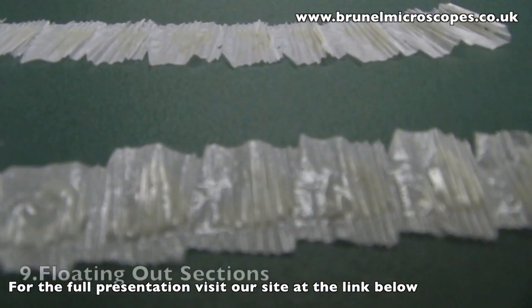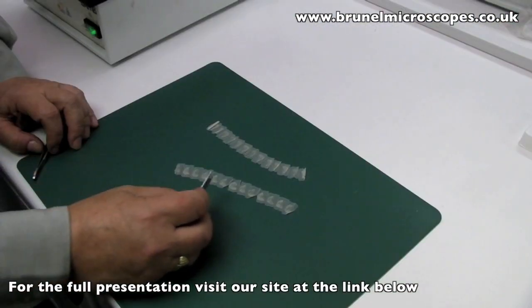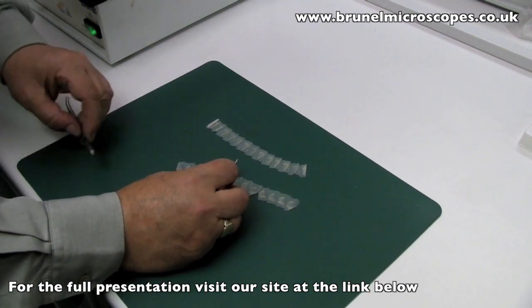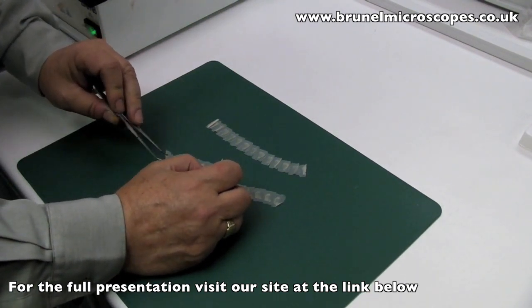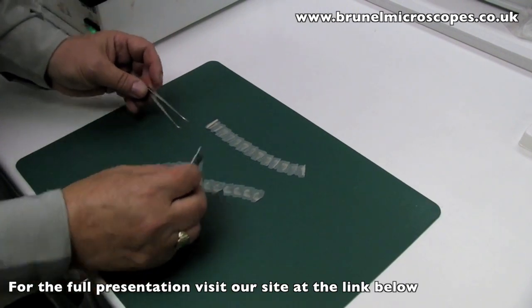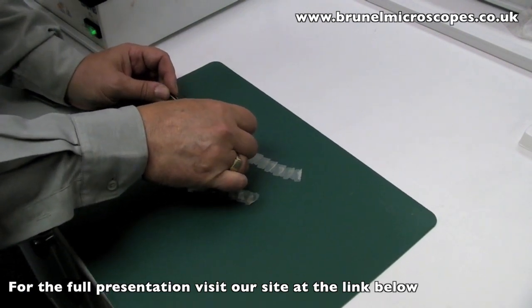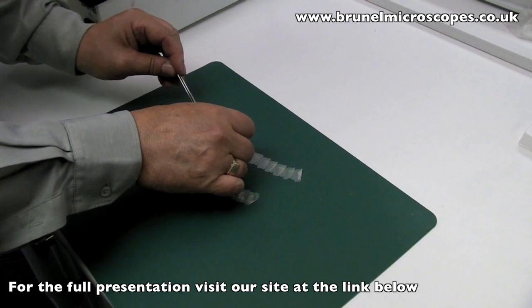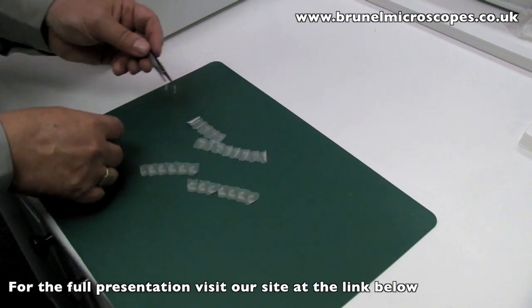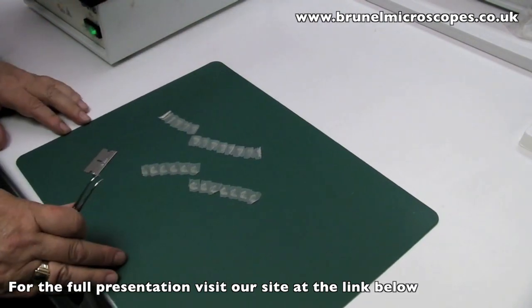The ribbon of sections will have a shiny and a dull side, as seen here. It is important for the floating-out step that the ribbons are placed on the water surface shiny side down. The floating-out bath should be at least 50 degrees centigrade, just below the melting point of the wax. This will flatten out and stretch the sections prior to mounting them on a slide. The ribbons can be cut with a safety blade into manageable lengths of about six sections.